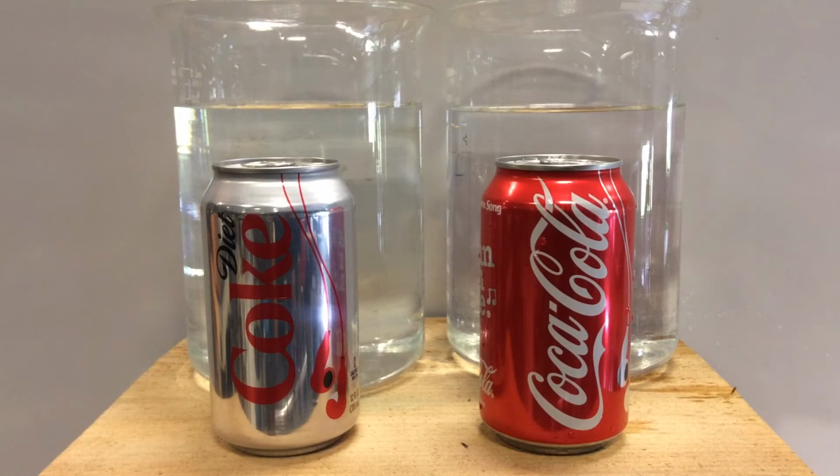In this lab, we're going to be looking at density, a physical intensive property that we've used previously to identify different compounds, including the aluminum that the soft drinks in front of us is being contained in. We're going to compare the soft drink's density with water, with the liquid behind it. This is something you may have noticed at a party or in a cooler of soft drinks where you have the diet and their regular forms, that their densities are different.